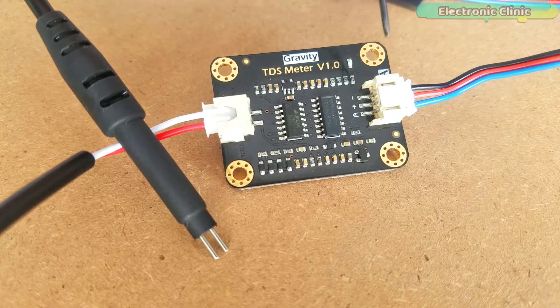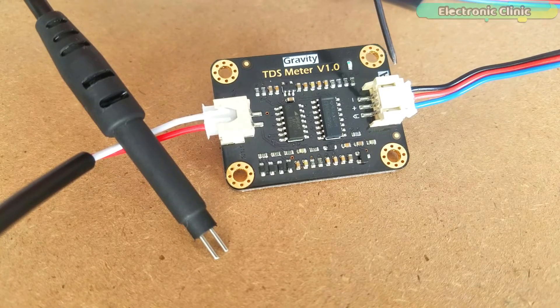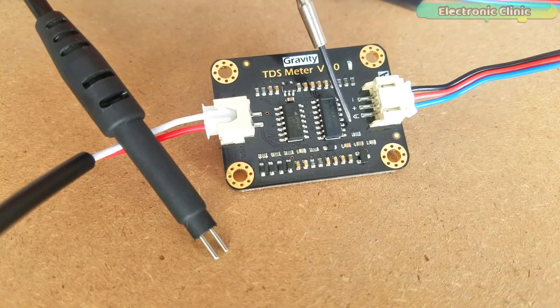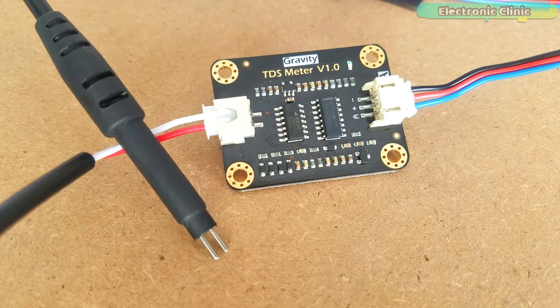The signal transmitter board has two connectors. The left one is the TDS probe connector. The right side connector is used to interface this module with Arduino or any other compatible controller board. The connector pins are labeled: A is the analog output pin and should be connected with the analog pin of the Arduino; plus connects with 3.3 or 5 volts; and minus is the ground pin.